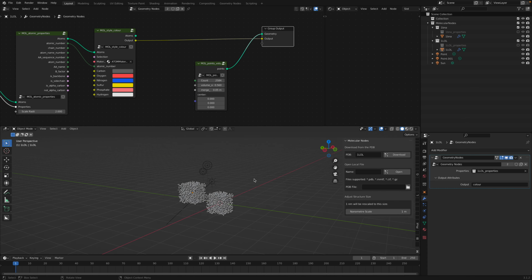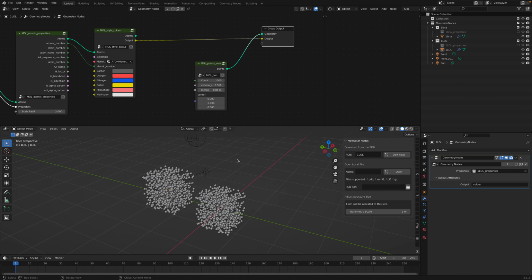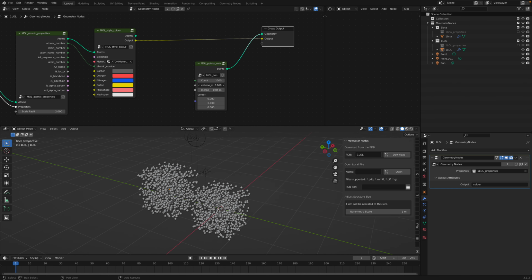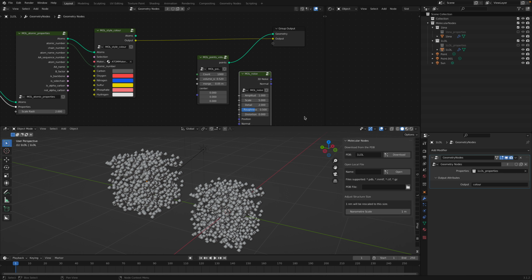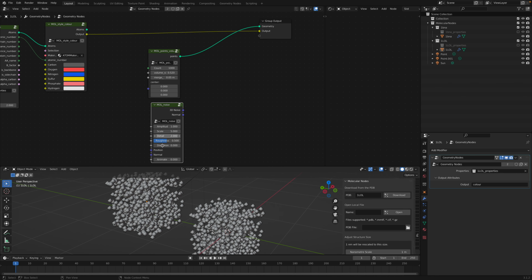Yeah, you have a bunch of random points in this volume. This is when it gets interesting because this thing will render as well, right? This one is random. It comes with the Molecular Nodes, and then you can also use the noise. There is a 3D noise, and there's the normal that you can pass.